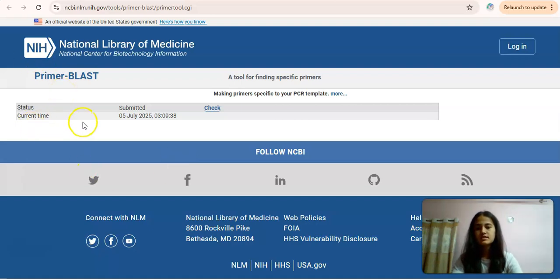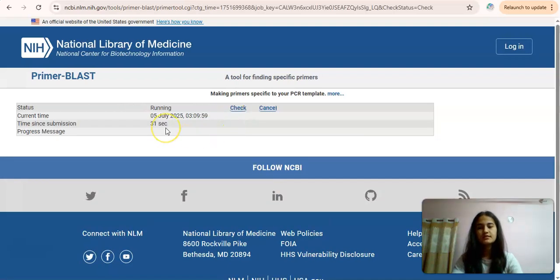So this is the same page we got earlier. The status is submitted, with the current timing and date of our submission. Or you can click on check, or you can just wait. You will be taken to our primer.